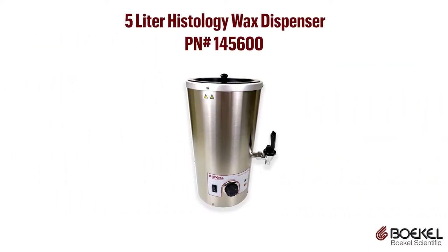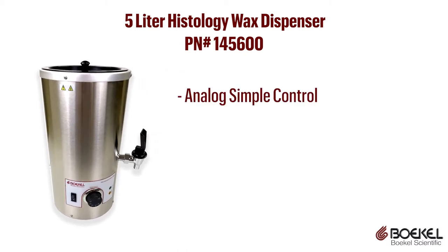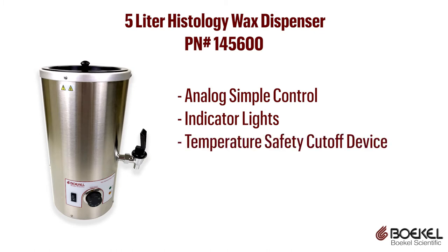For embedding, Boekel Scientific has the 5-liter histology wax dispenser. The 5-liter wax dispenser has analog simple control, indicator lights, and a temperature safety cutoff device.